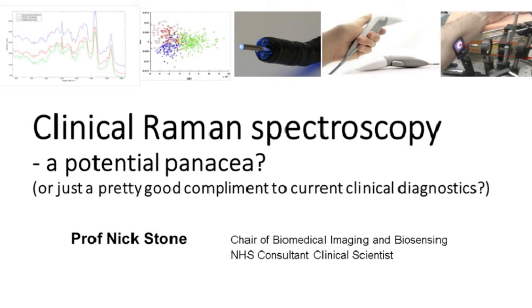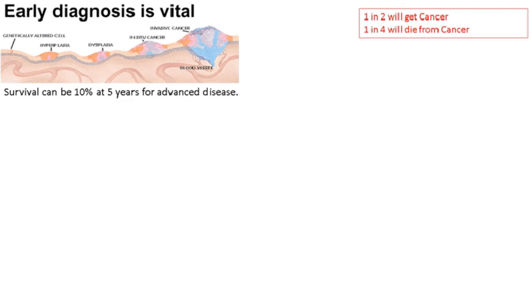I'm going to talk about Raman spectroscopy, and it's a complement to Brillouin. It's looking at inelastic scattering of light, but from the molecular vibrations that are induced in the materials that we probe. I will explain the concept of Raman as we go. And so I want to put it into context really.